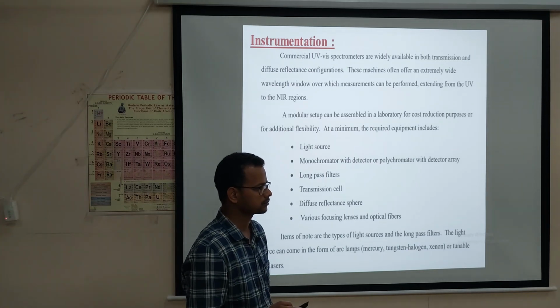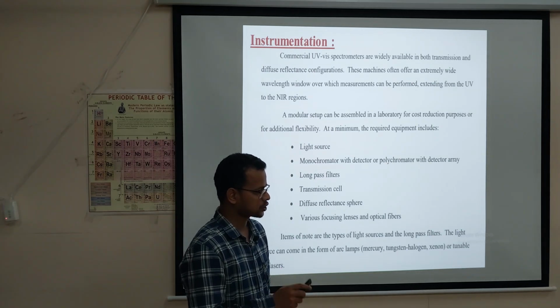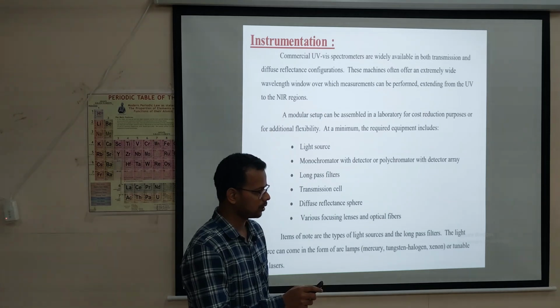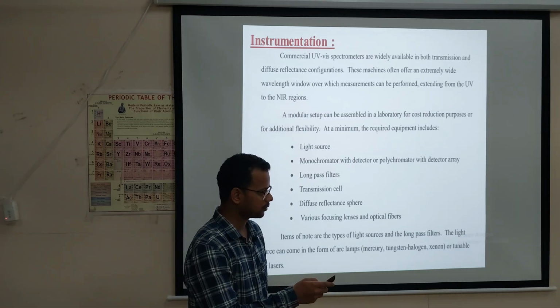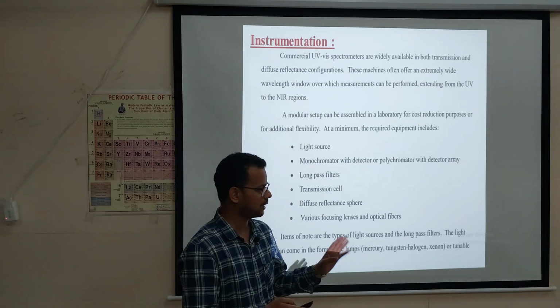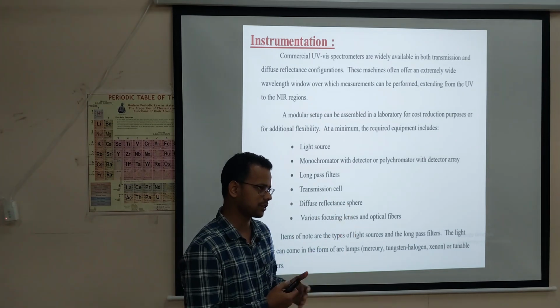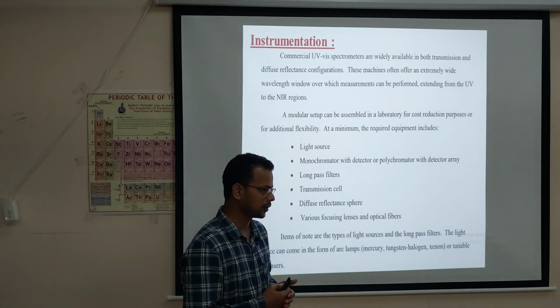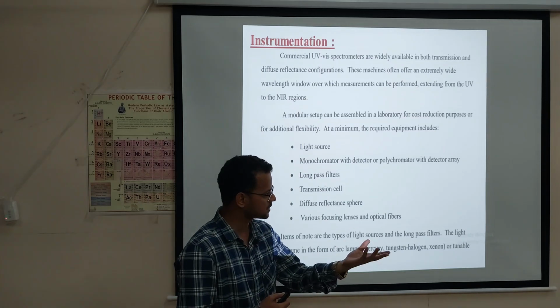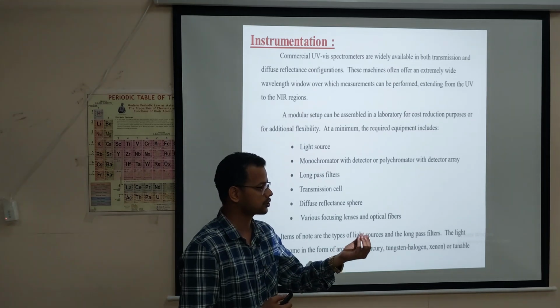By UV visible DRS we can analyze solid samples as well as liquid samples. For liquid samples, we can do quantitative measurement: how much solid is present in the solution.